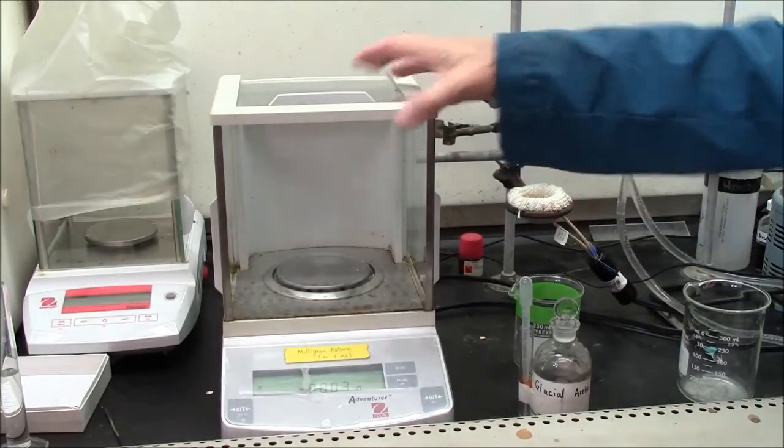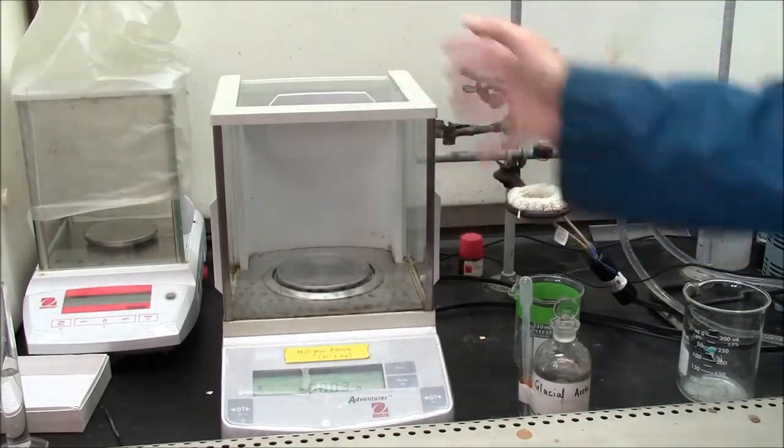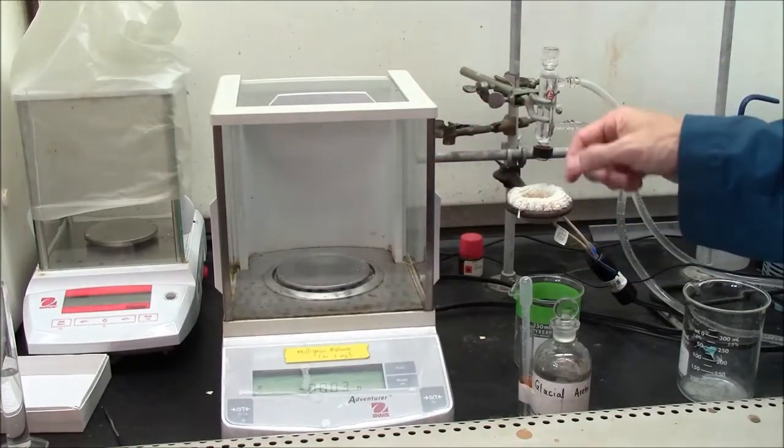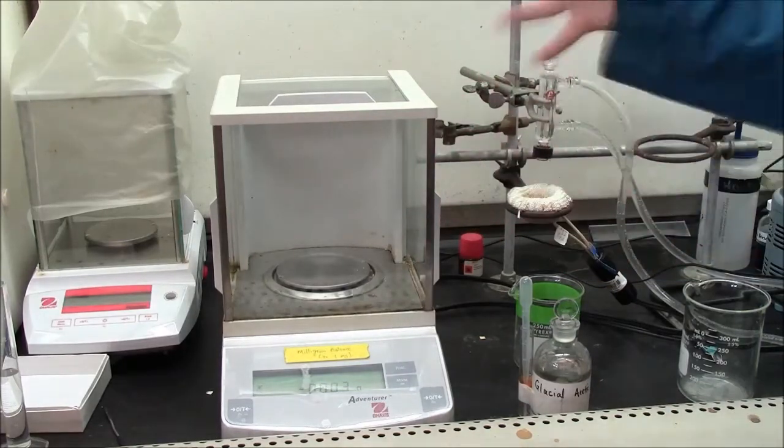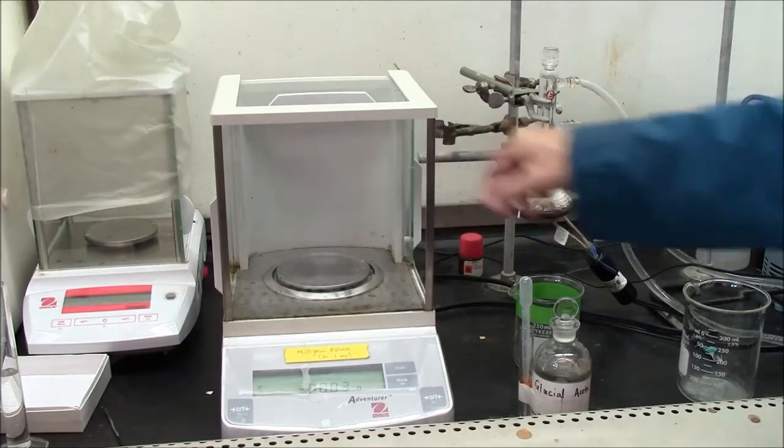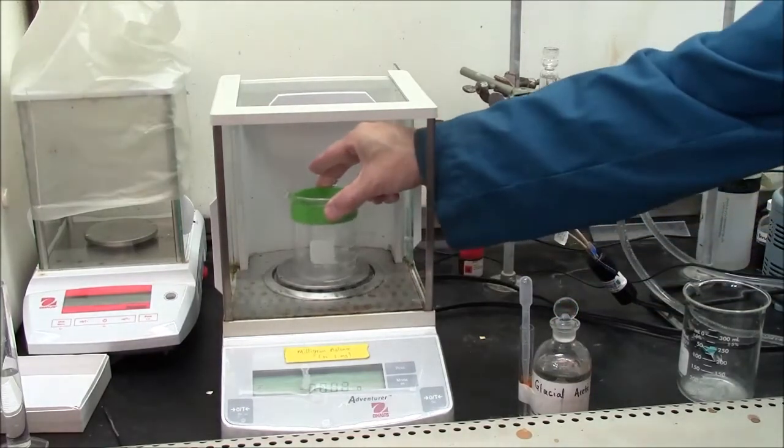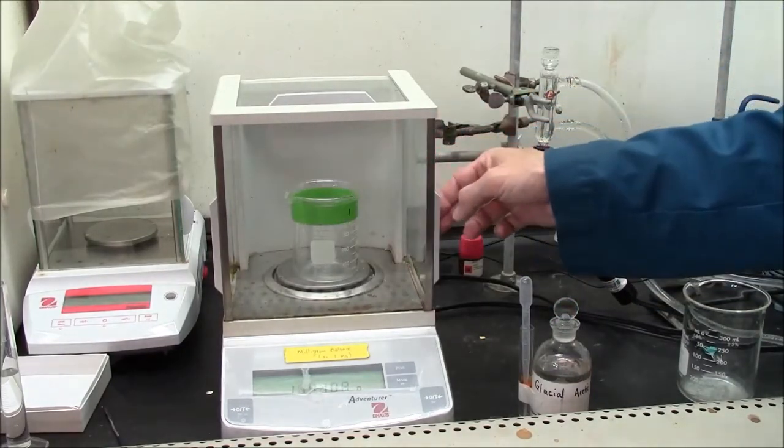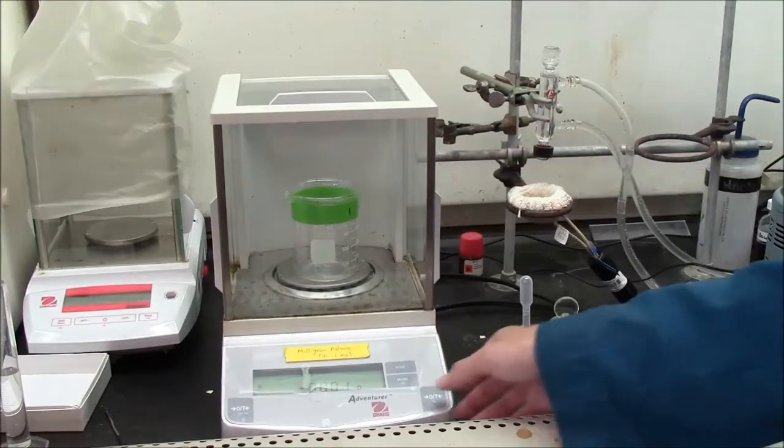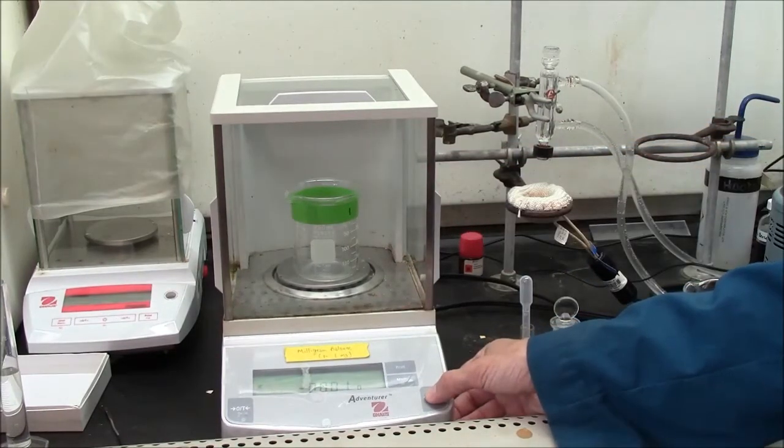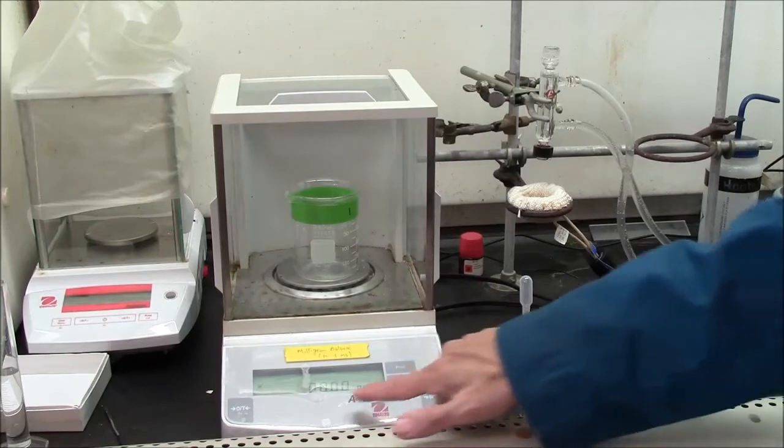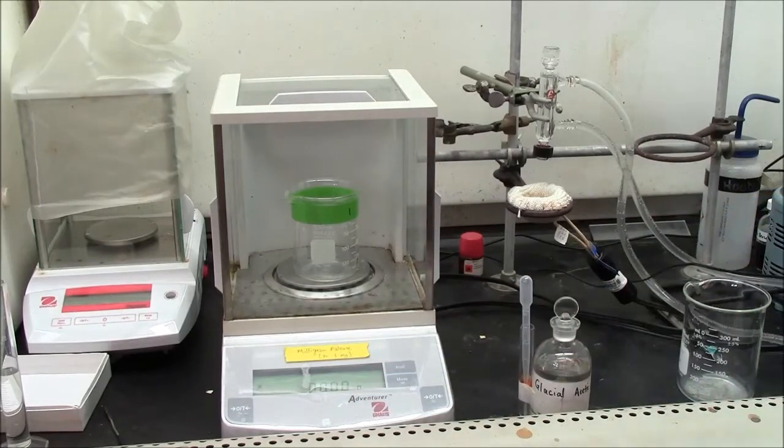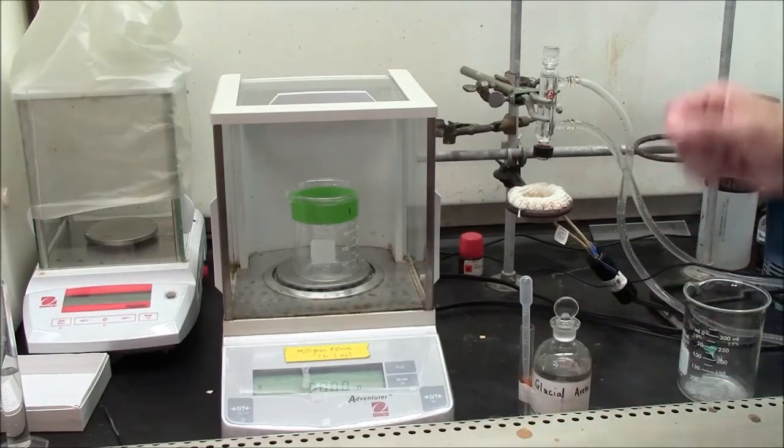You'll use this balance. It has draft shields around the platform. This protects it from air currents. You'll need to open a door and put your beaker on the platform. Close the door. Zero the beaker. This now reads zero. It has one more decimal place than you're used to.